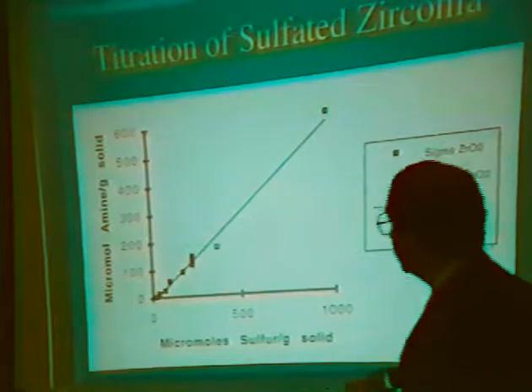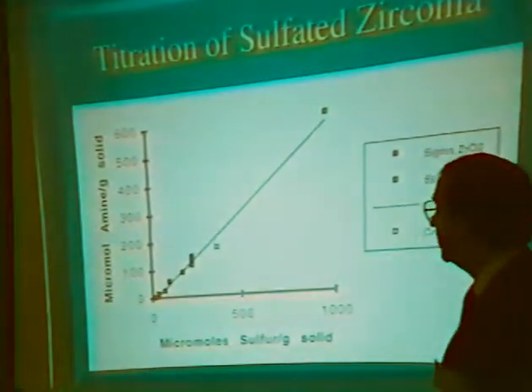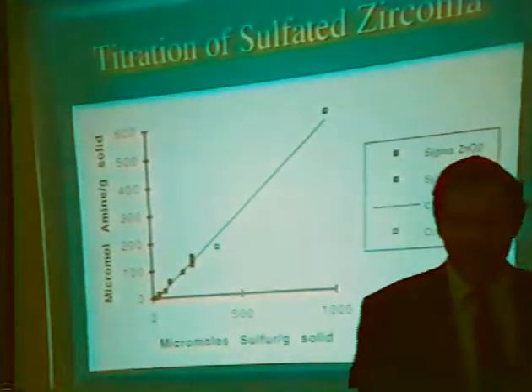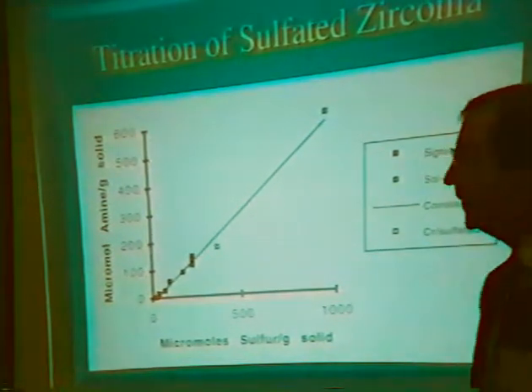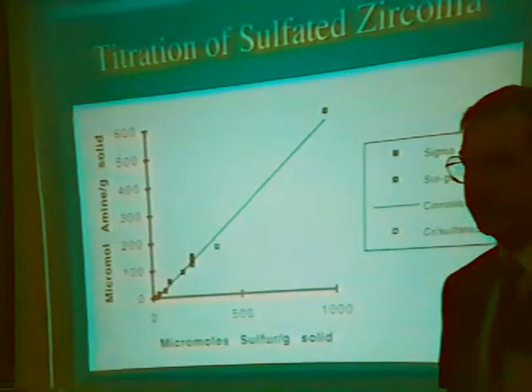And then the measurement that we would make would be the ordinate. For one of the samples, I asked the student to repeat it 4 different times on different days of the week and so forth. And the idea is that gives us a feeling and appreciation for the uncertainty in this technique.